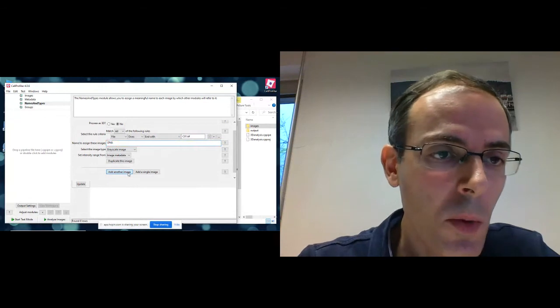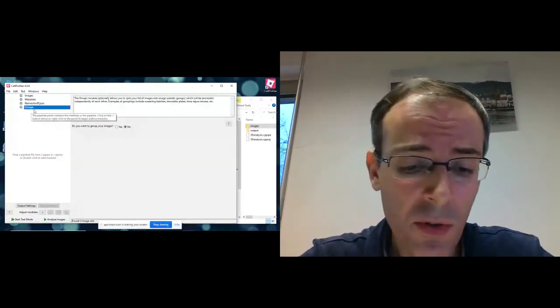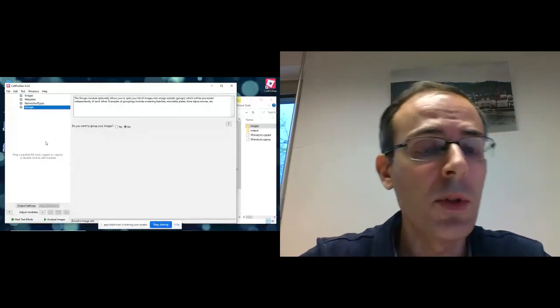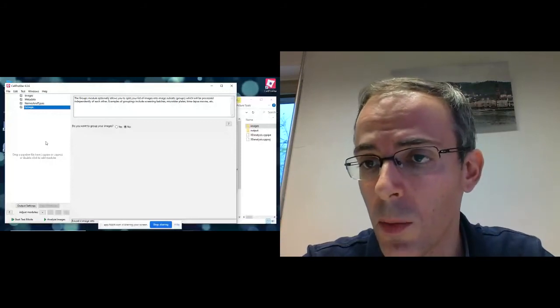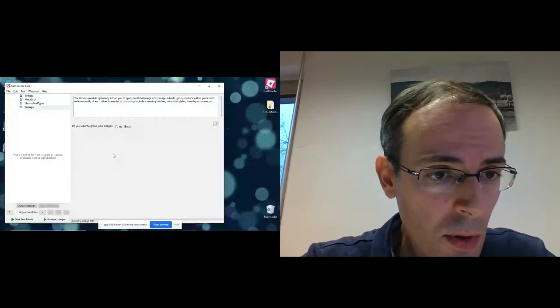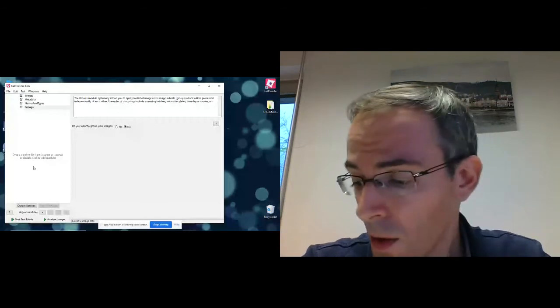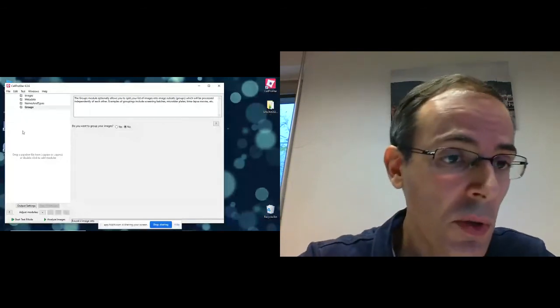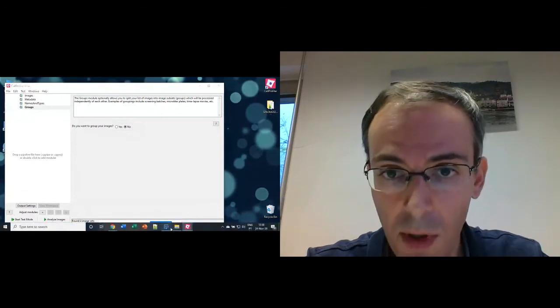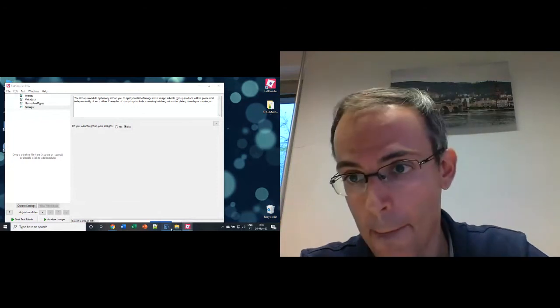Then we may want to group images. This is typically done for time-lapse images, where groups of images belong to the same time-lapse, but today we're not going to be using groups at all. Okay, so let's start adding custom modules for this analysis. The first thing we may want to do actually is take a look at the images. So let's maybe use Fiji and open one of these images.